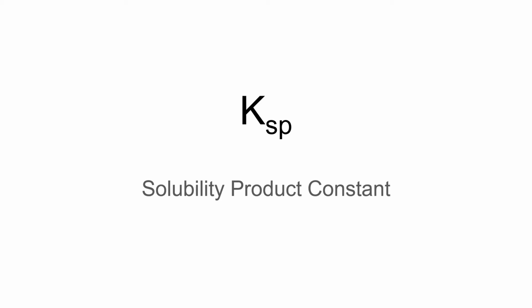So we'll review a little bit of the principles of solubility, focusing on solubility of hydroxides, and also understand how pH measurements can be used to determine the concentration of species in solution, which in turn will help us to determine the KSP of the solution.